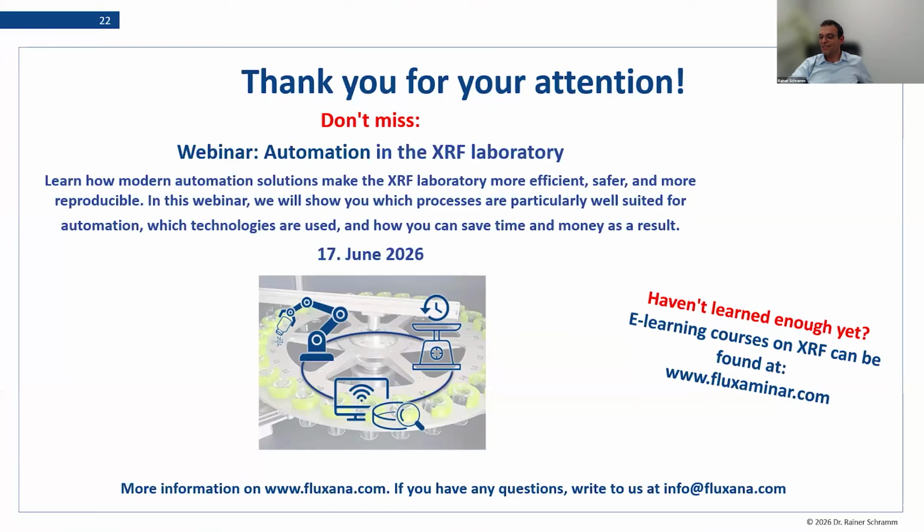Okay, more questions. Should you mix the sample material and flux manually before putting it in the furnace, or is the automatic agitation enough? No, I think it is better you mix it first so that every sample particle is surrounded by flux, because this is like when you put sugar into your tea, when you stir and make sure that the powder is not in one lump, it dissolves easier and quicker.